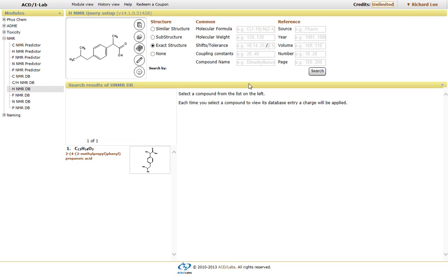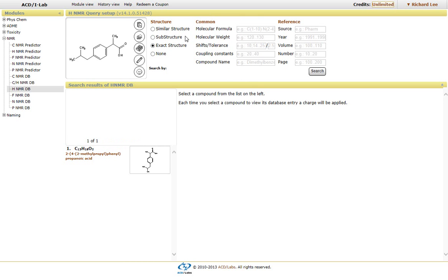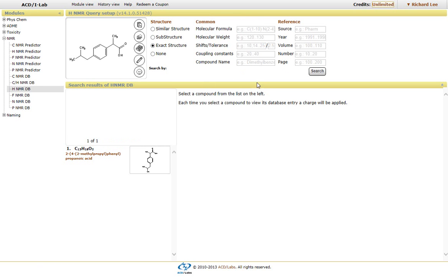And again, you have the option of looking for similar structures, substructures, or the exact structures, as well as the ability to find or place some restrictions upon the actual search criteria, whether it's molecular formula.